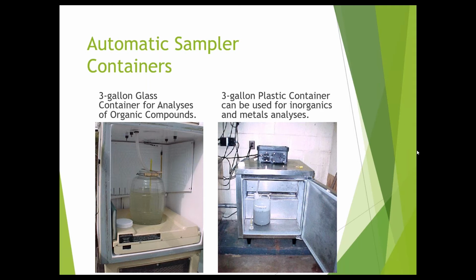Now, from the time the sample is poured until it gets to that 6 degrees, you do have at least 2 hours. Within 2 hours, it's considered in cooling or in the process of cooling. If you're transporting it and you get it to the lab within 24 hours, it may be flagged, but you can say it was in the process of cooling as long as you can show it was always consistently on ice.